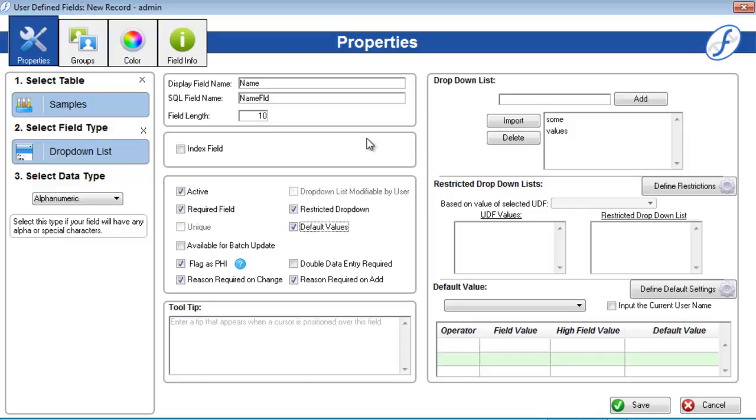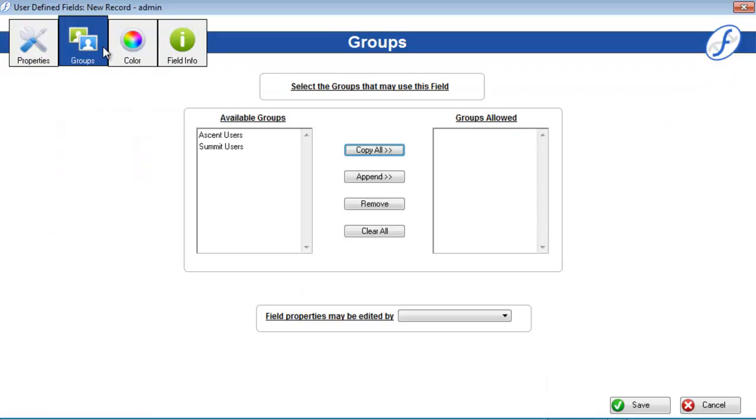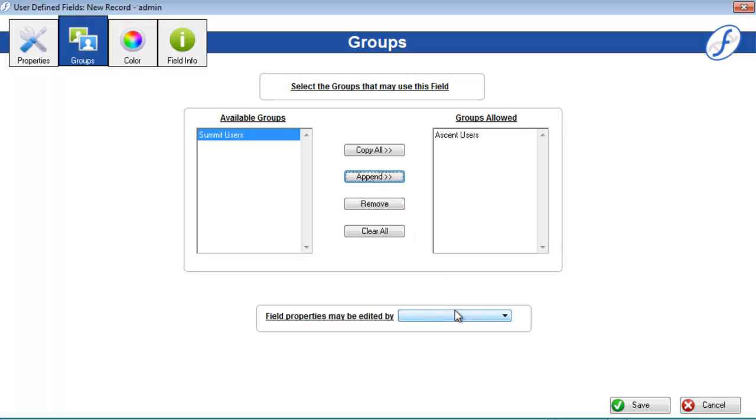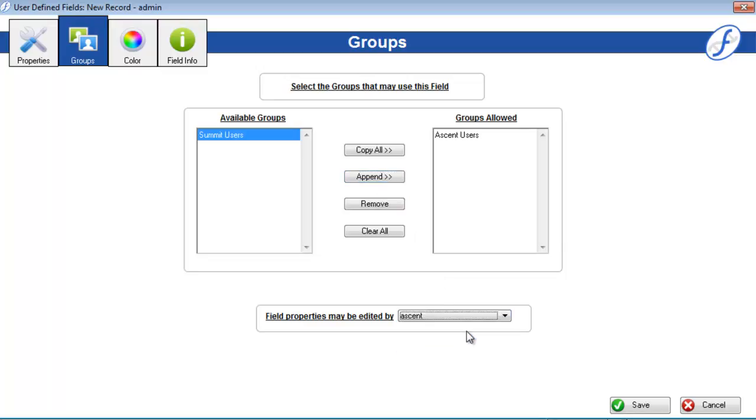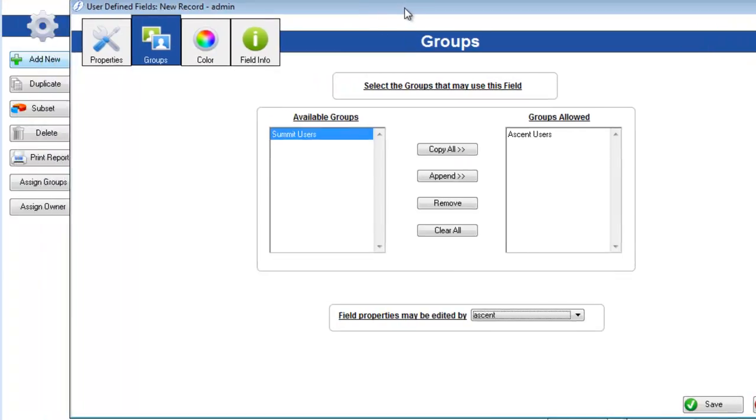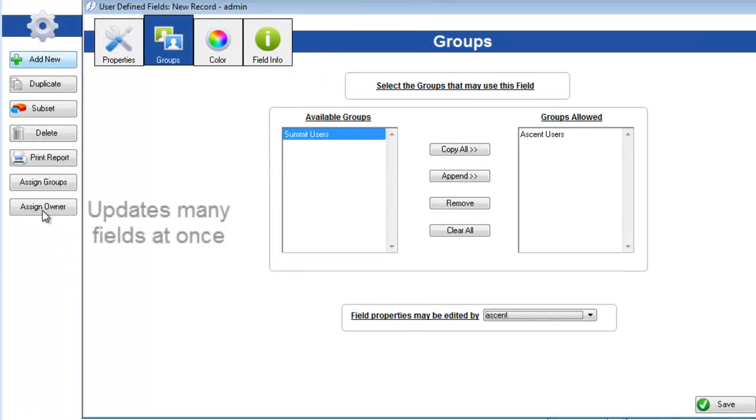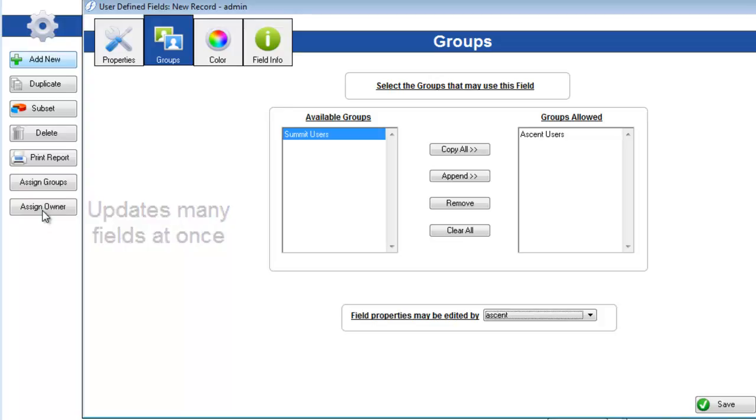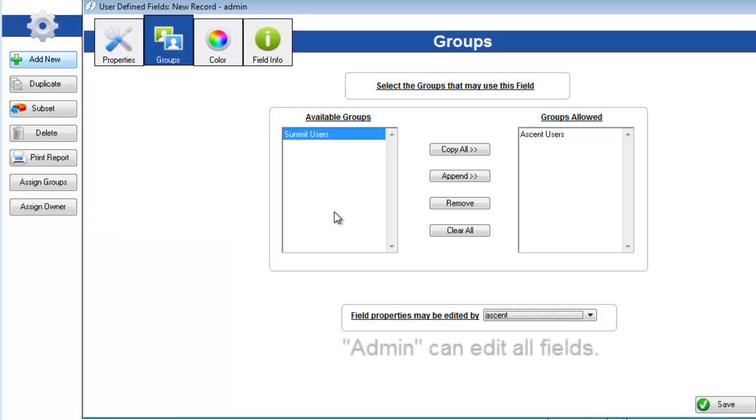We talked a little bit about the groups page in the security video. Assign the groups that you want to have access to this field by double-clicking or highlight and click append. The drop-down at the bottom is different though. This controls which user will have the sole power to edit the properties of the field after it is saved. This can be done one by one on the groups page, or you can click assign owner on the user defined fields list view. Note that the admin super user will have access to all fields no matter what.